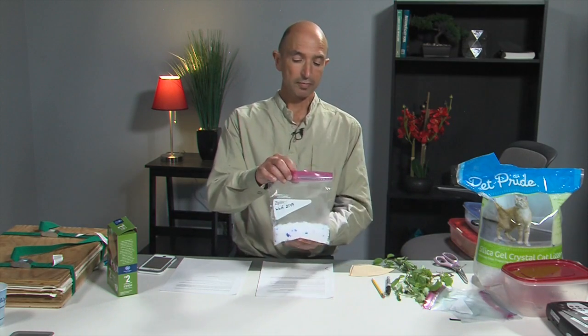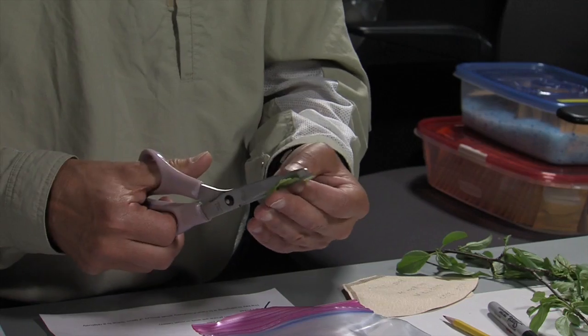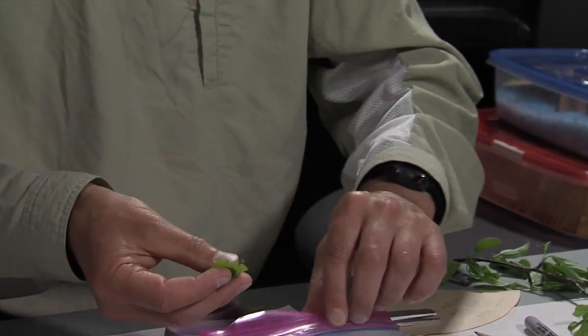So the key to getting a good sample in the field that's to be used for DNA extraction later is to get the plant material to dry as rapidly as possible. And to do that, you need a good ratio of drying agent to plant material, typically about a 10-to-1 ratio in terms of mass. So that's how much silica gel I use in a plastic bag. And typically for that, I'll only have about 5 to 10 square centimeters, that's about 1 to 2 square inches, of leaf material. So typically one leaf that big is really all you need. And you can cut that in half. You can tear it with your hands in most cases.